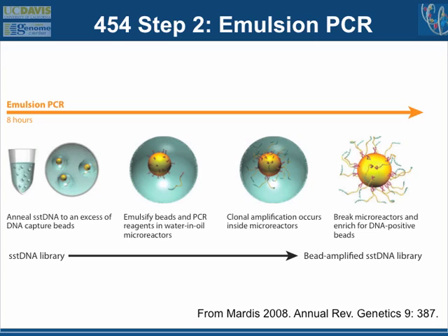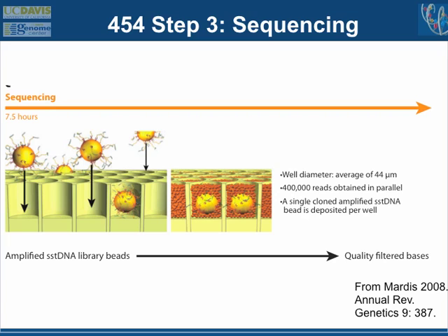And this is one of the biggest sources of failure of these methods, like the Roche sequencing method. Frequently, the emulsion PCR step and the bead counting and the bead sort of working is the problem step. And so you run this PCR inside these little microbeads. You purify them and prep them in some way, and then you take these microbeads now that have hopefully millions of copies of your original piece of DNA in each little bead, and you put them into this flow cell.